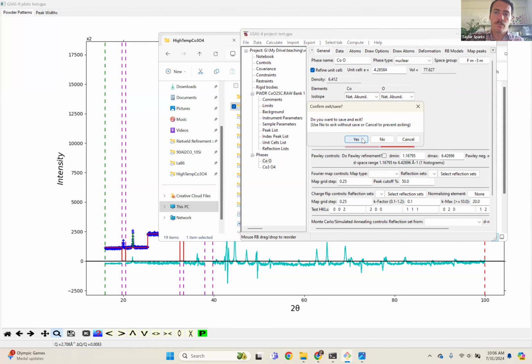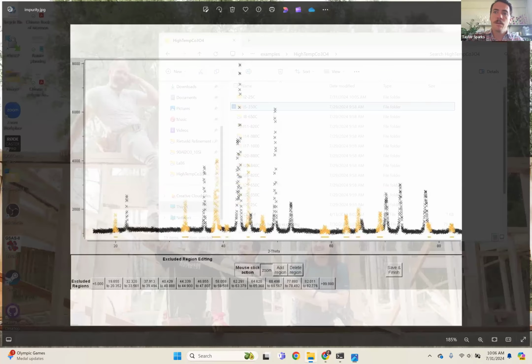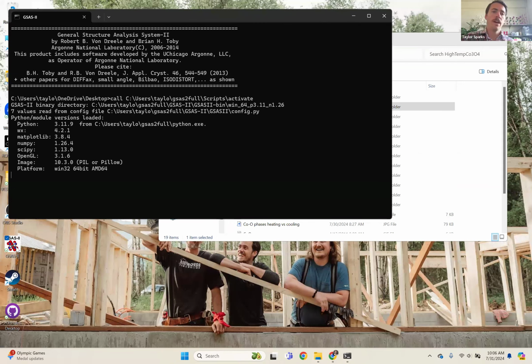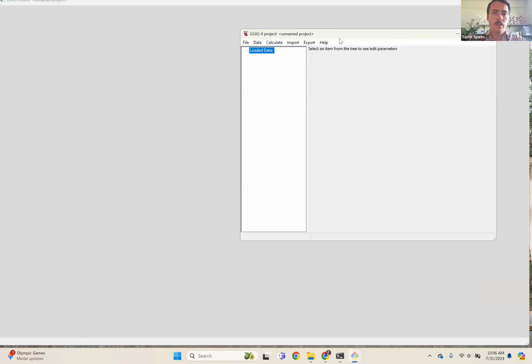So I'm going to close my GSAS for a moment. We're going to reopen it one more time, but we're going to do it at high temperatures and show you what's happened. So I'm going to come over here to GSAS, and we're going to just really quickly open up that one at 1,000 degrees. And after this, I promise, we'll switch over to VESTA, and we'll talk about VESTA and plotting in our next class. But one last thing to cover here.